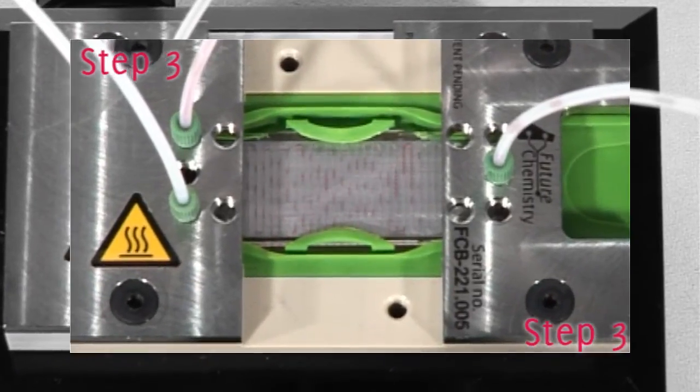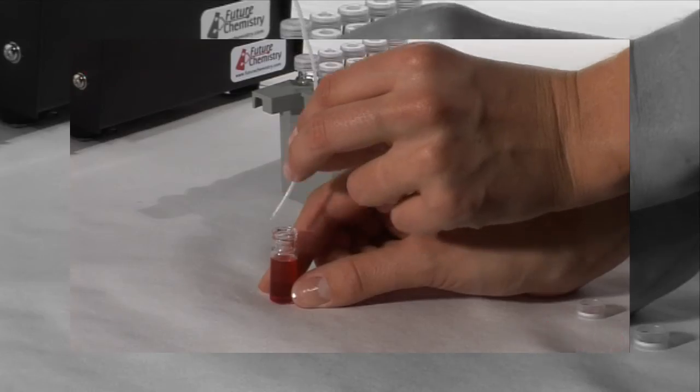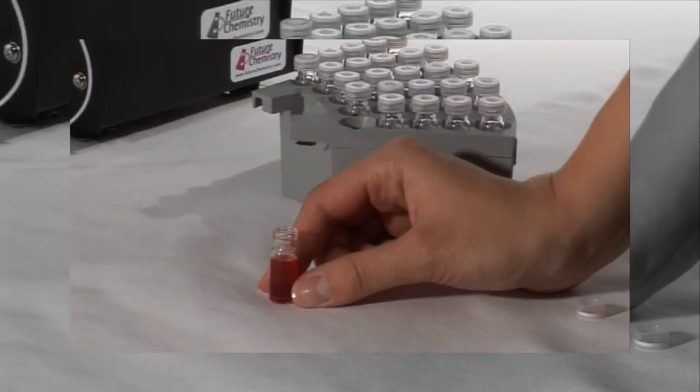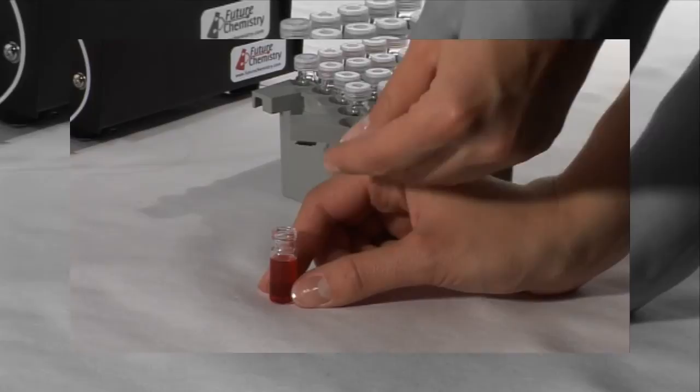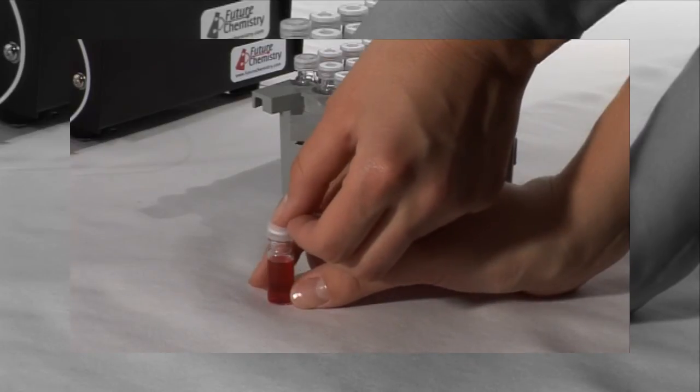The end product is collected, ready to be analyzed using any conventional analytical technique.